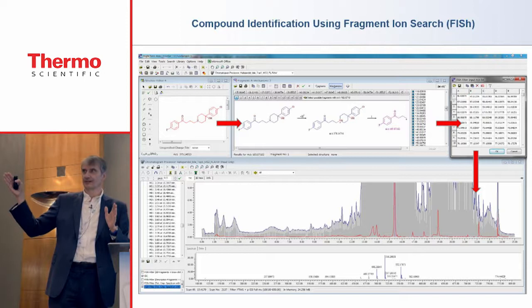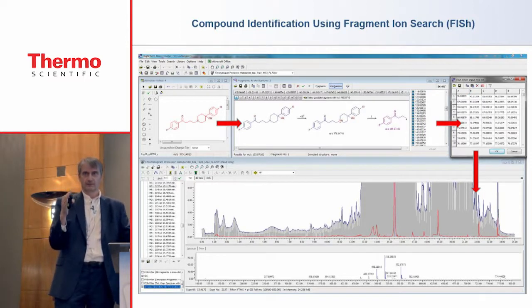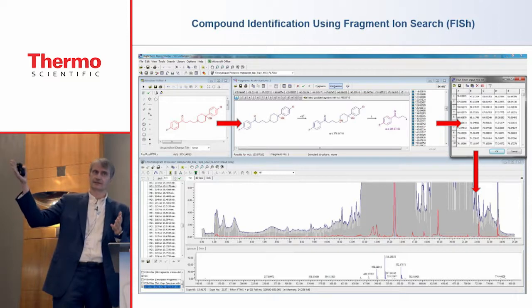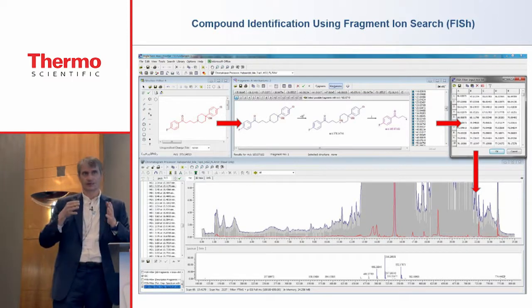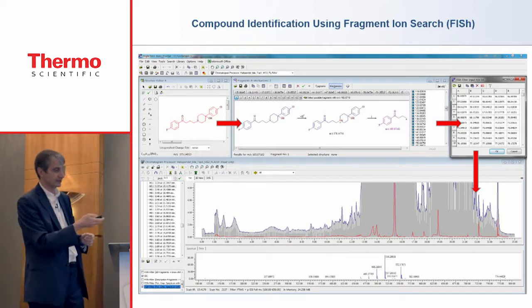You try to find a relation of a compound with a complex sample. So it can be very well used in impurity search, because you can take the precursor compounds or all the chemicals that were used to produce these compounds and search them in a chromatogram.